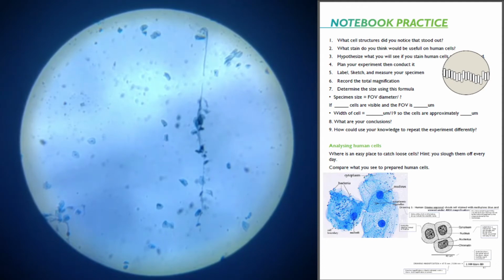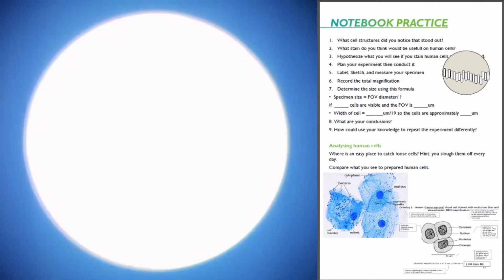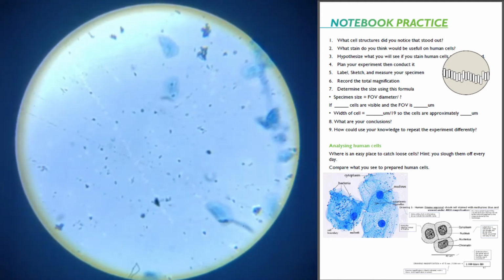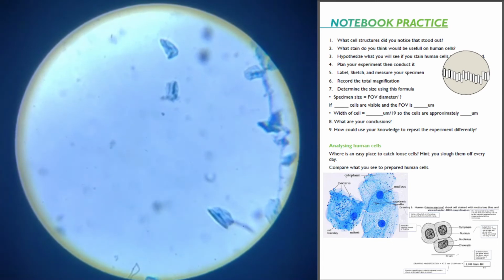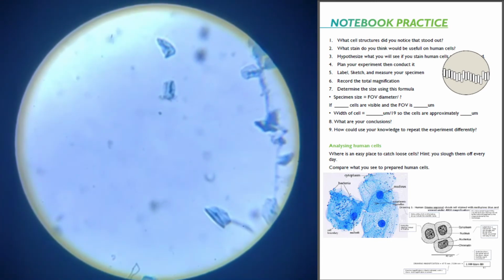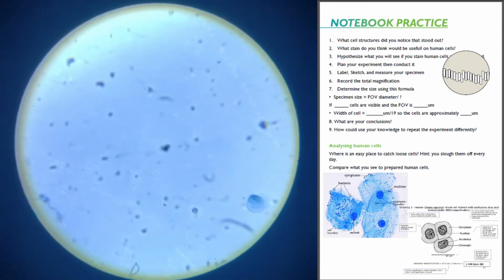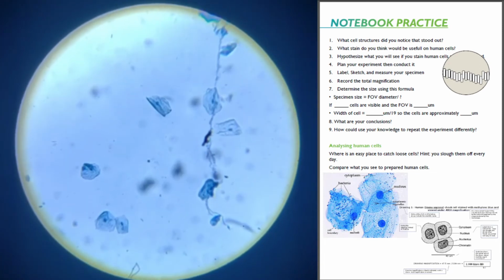Nice. Okay, I'm on scanning. I'm going to go in a little closer. There you go. There are 3 cells. Several cells there. So I'm looking at 100 times magnification.